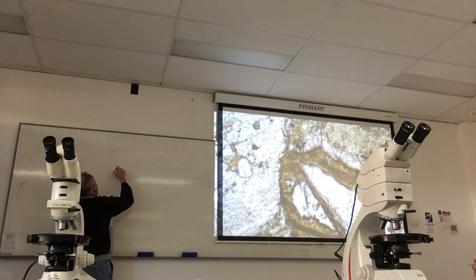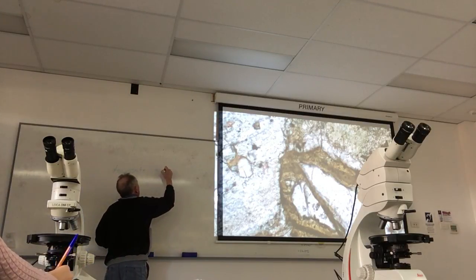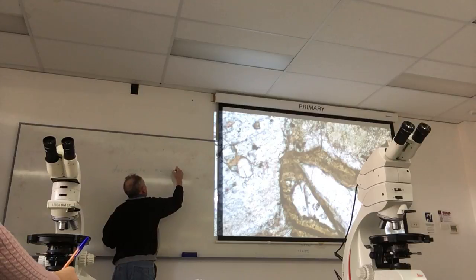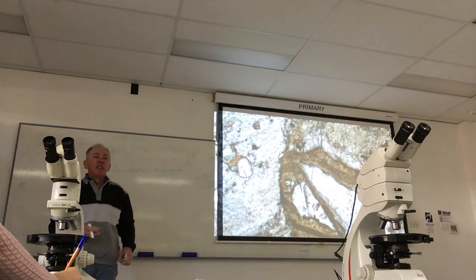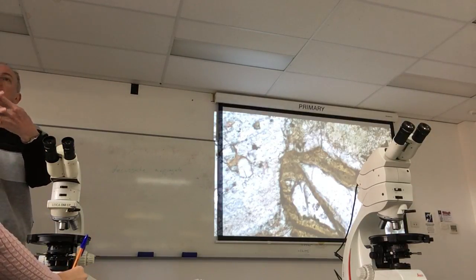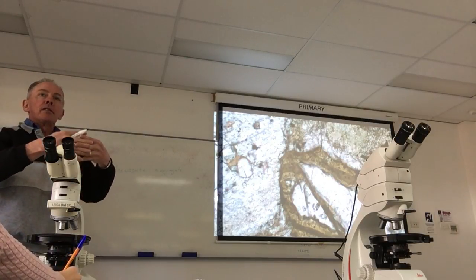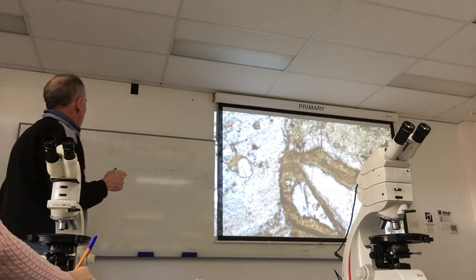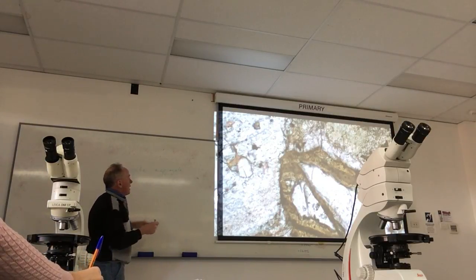I think I've written this up before. They call it a decussate aggregate. And that doesn't mean it doesn't swear. Decussate means that you've just got randomly oriented crystals. I'm assuming cussate means that they're aligned. I've never looked up what cussate means. So that's a fancy name for that one.